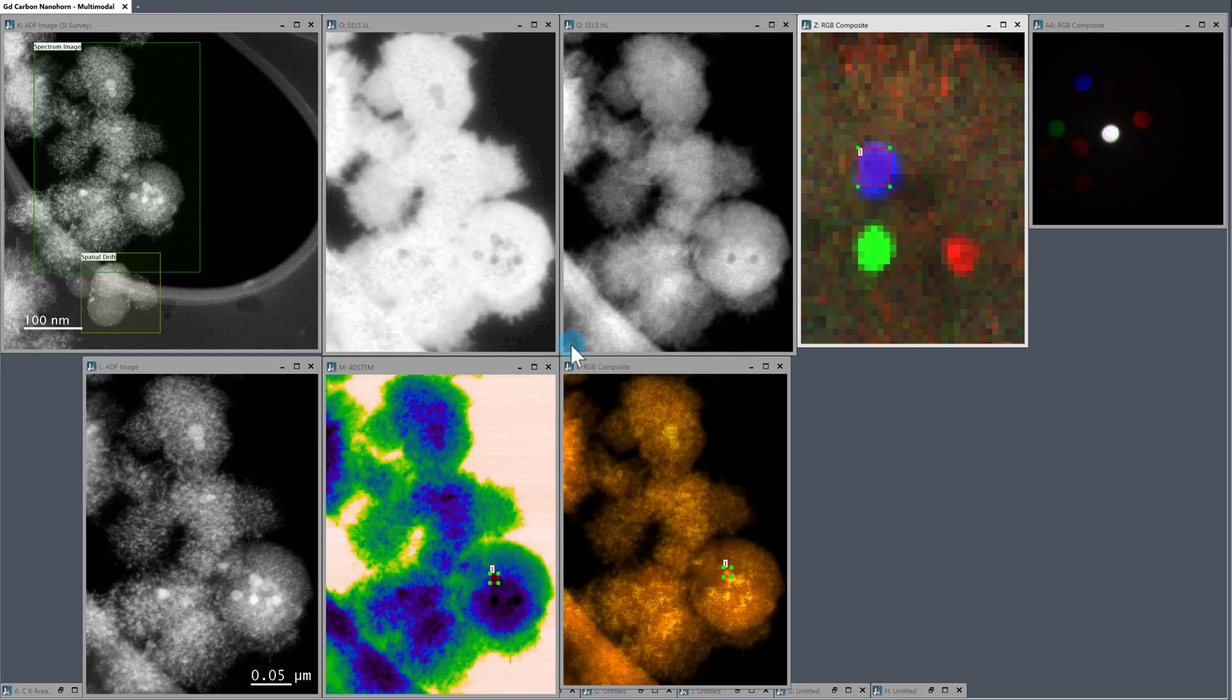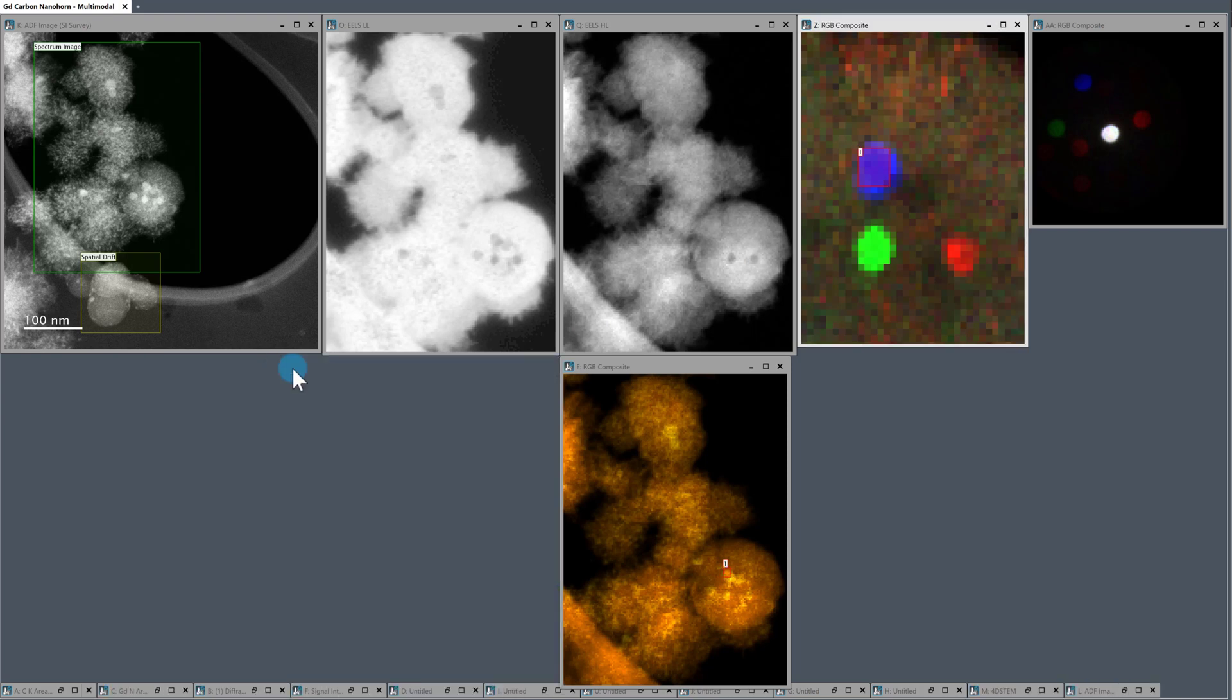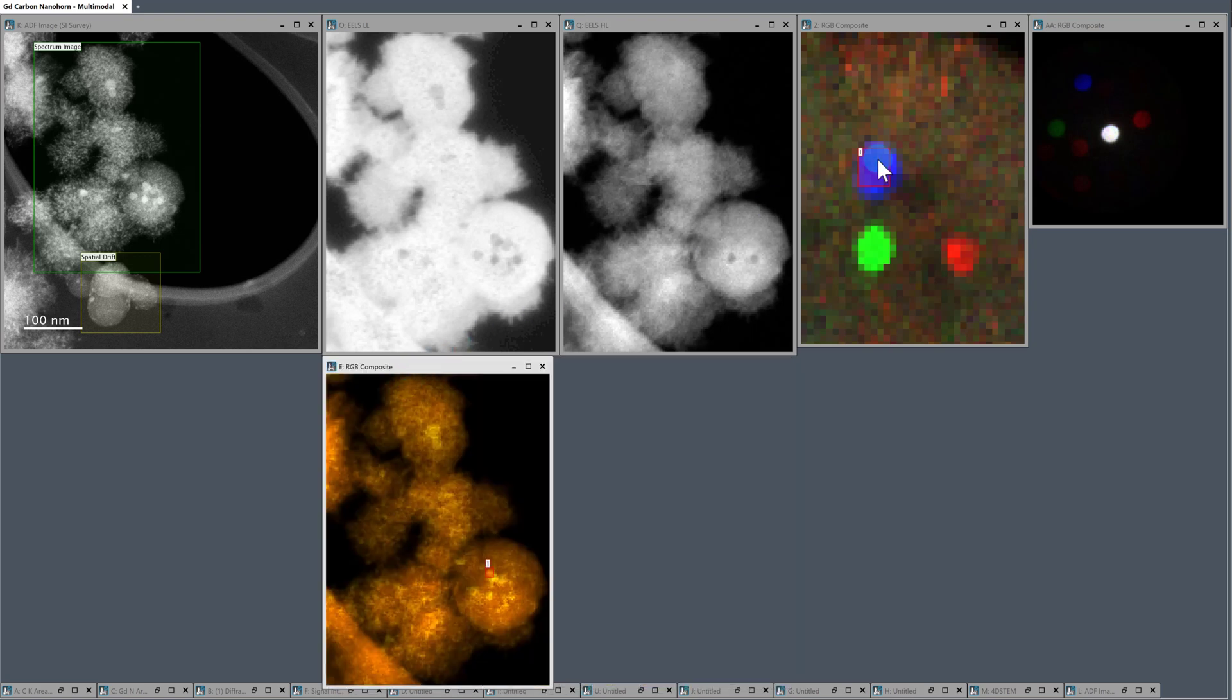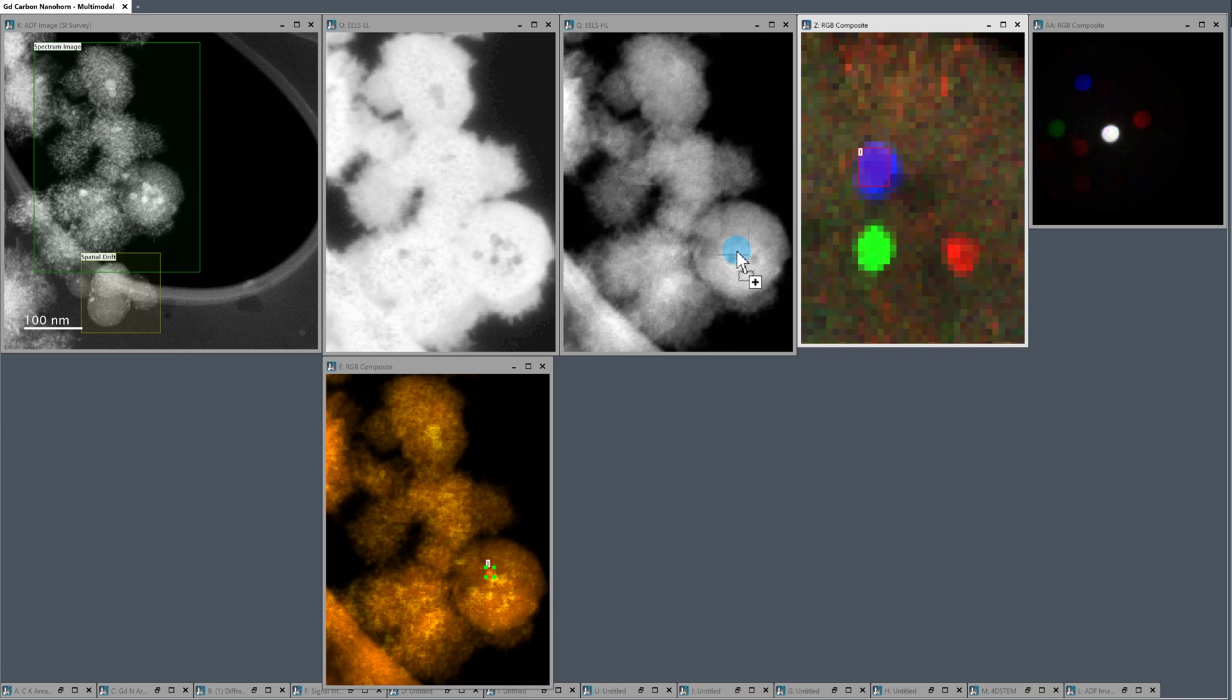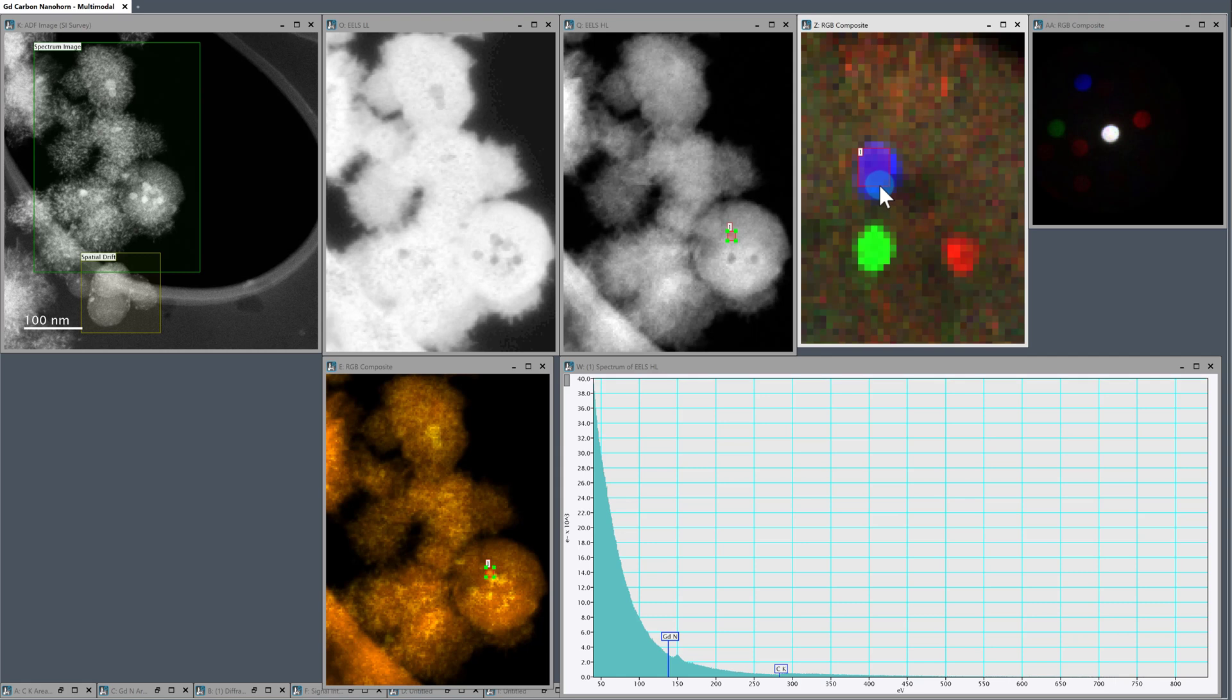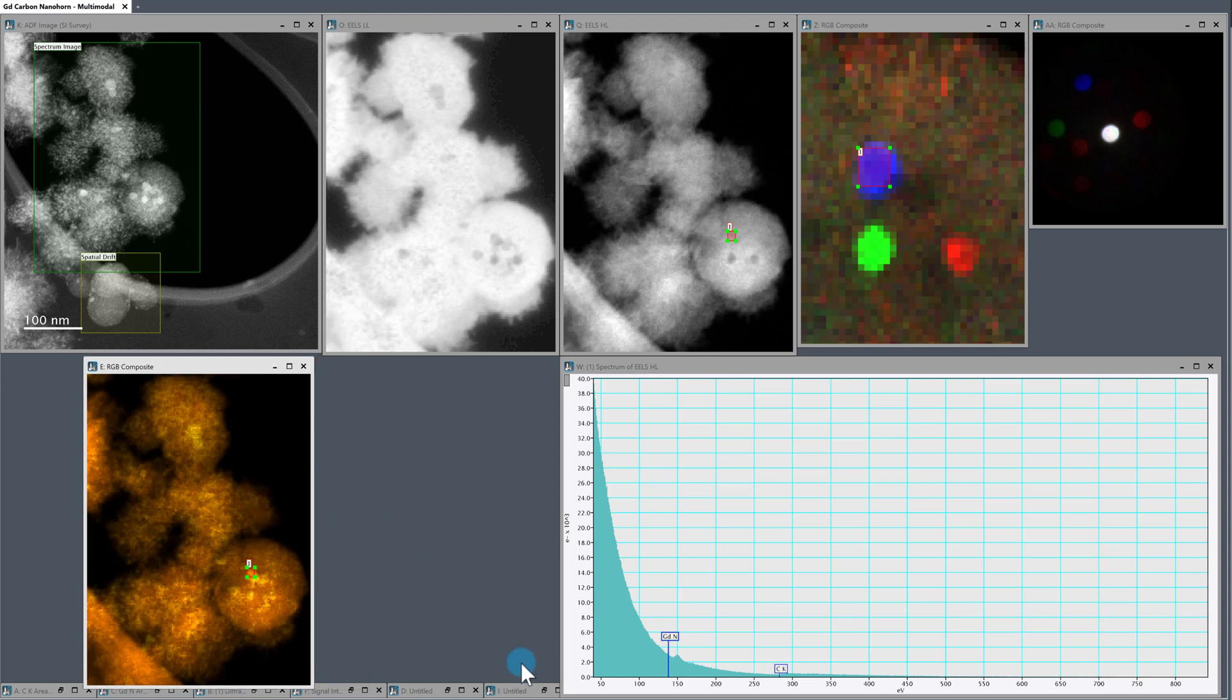And what I now want to go and do is actually go back and look at the EELS data. So we were interested in basically the chemistry of this, the chemistry of this, the chemistry of this. And we can do that by just dragging this picker again back onto the high loss EELS dataset. And there we go. So let's maybe make this a little bigger so everyone can see it a bit more clearly.